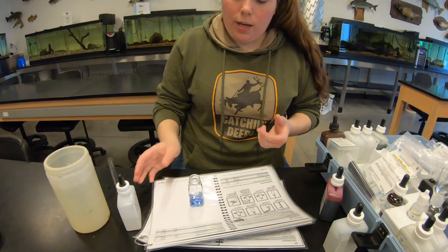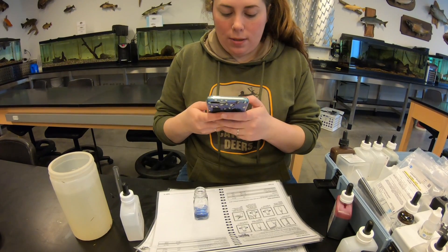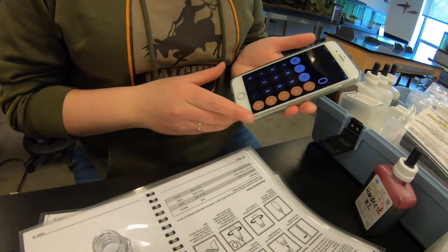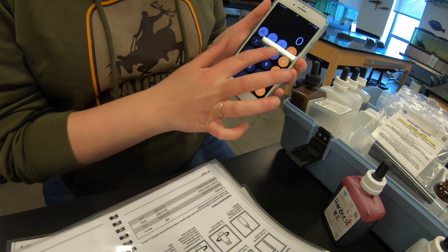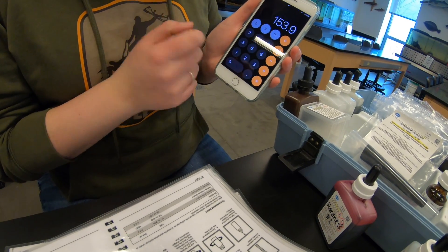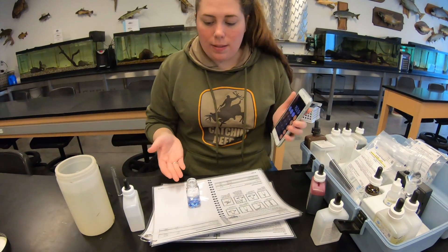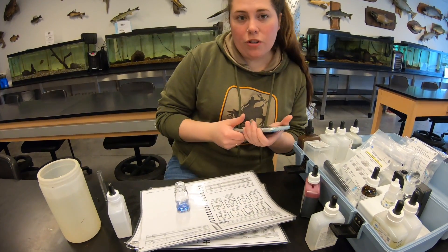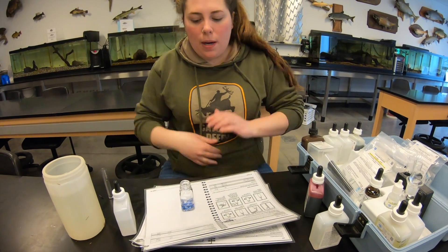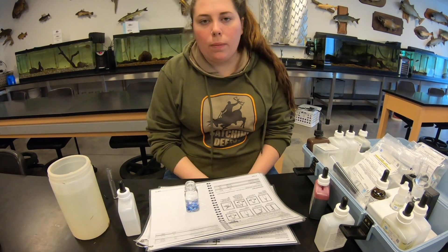Just like the alkalinity, we multiply the number of drops by 17.1. Nine times 17.1 gives us 153.9 - same result as alkalinity. This is within the optimal range of 100 to 400 mg/L. Hardness measures your calcium and magnesium ions, which are used by plankton, so this is a good result for any water body.